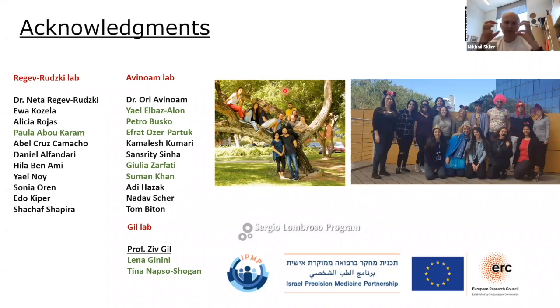And of course, in all your pictures, you don't really see membrane proteins, and I'm not sure if your artificial vesicles even have those. So I'm kind of curious about your general comment about the effect of surface decoration on fusion. And the other thing that I noticed when I was looking at your results is that after you shaved your EVs by digesting them with proteinase K, your results don't show a reduction in the hydrodynamic size, which, in our experience, and other people reported that as well, after that treatment, the hydrodynamic size reduces quite substantially.